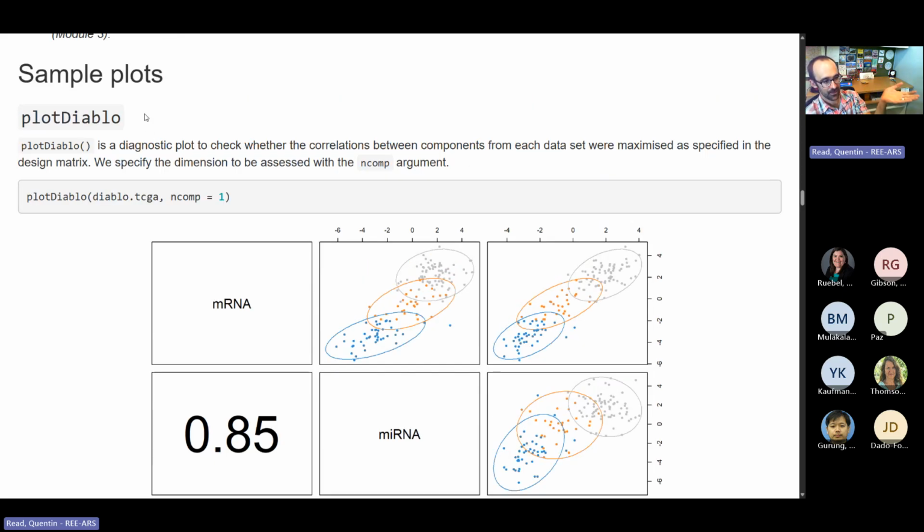Now we're basically going to do a bunch of plots to take a look at what pretty pictures we can draw from the analysis we just did. They will be informative visualizations that could go in a manuscript and help people see patterns in your data, and you can tell biological stories about them. That's the rest of the demo, which I'll cover for the next few minutes, and then at that point we can do office hours if anyone still wants to stick around.